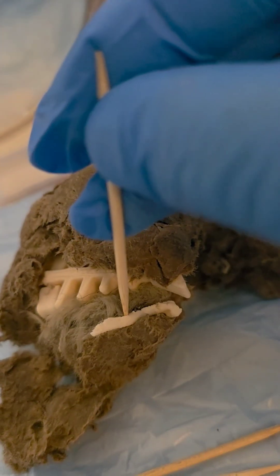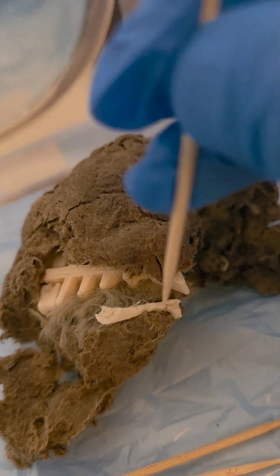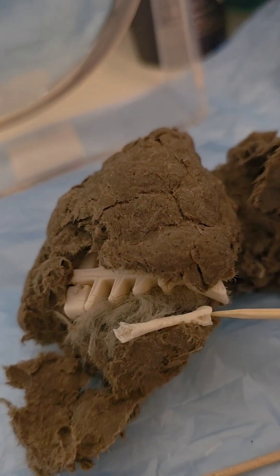Wow, look at that. It's a bone of a small mammal — maybe a rat, a mouse, a shrew, or even a vole. I wonder if you see something in a hole.